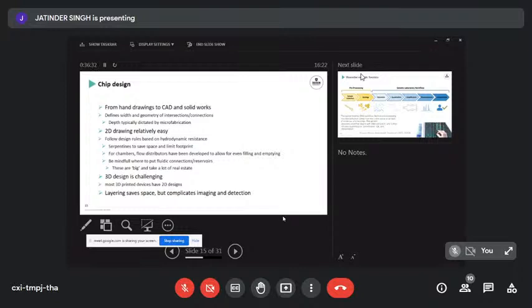So the channels are not the only thing to think of. You need to interface your microfluidic device with the world. The connectors to do that interfacing are big. You're talking about a 50 micron channel and a 5 millimeter fitting. Your fitting is going to dominate what you do, not your microchannel. So a lot of real estate will be taken by your fittings. If you want to put a detector in place, try to put a microscope objective in a microchannel. Most of your real estate, you pretty much have space for your connectors and your microscope objective, and that's your whole chip done.